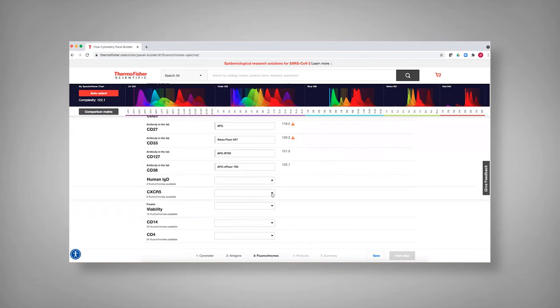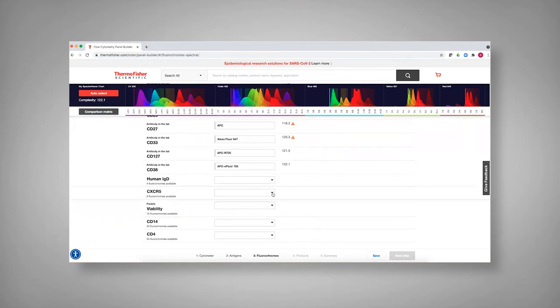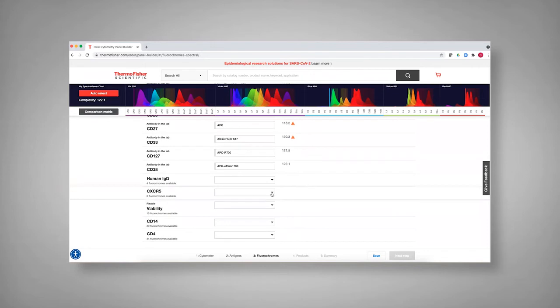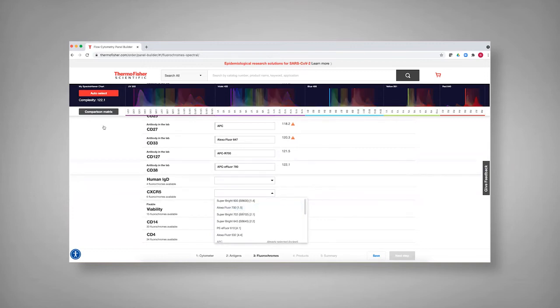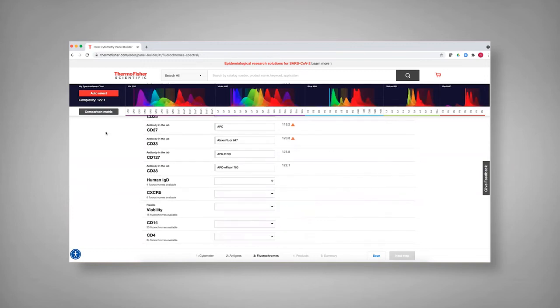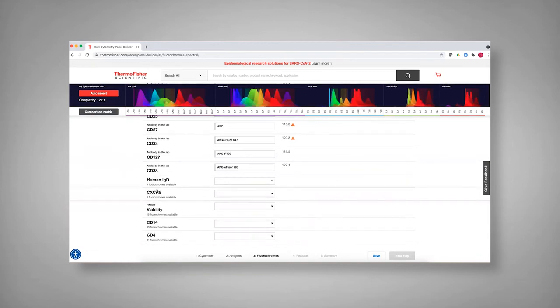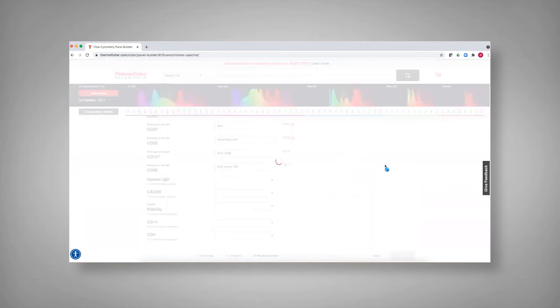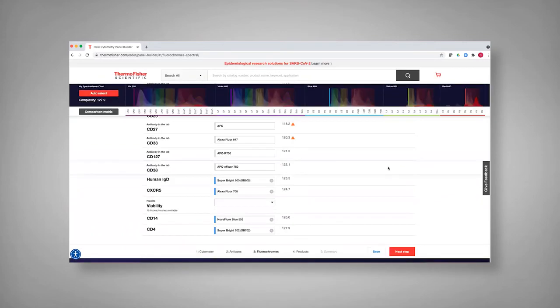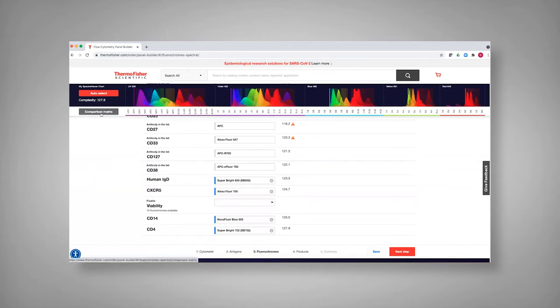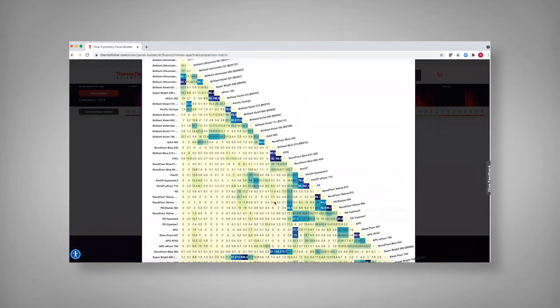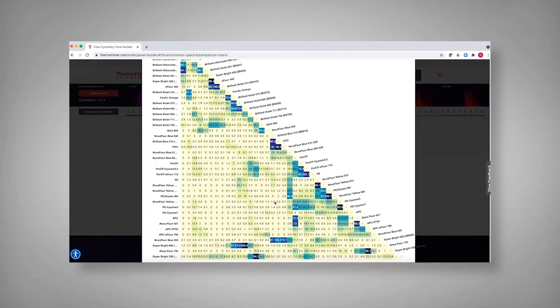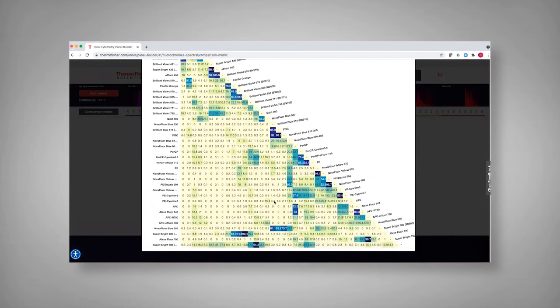In addition, then as you select these, you can see that some of these are going to be more bright dyes. For instance, Super Bright 600 is going to be bright versus Alexa floor 700, which is going to be a dimmer dye. And so if you just want to allow it to computationally assess what you should add, you can say auto select. And what you see now that's happening is it's actually going through and saying, of those available dyes, what adds the least complexity. Now, I would still suggest going back to the comparison matrix and really assessing places where these might be more similar than you'd really want to use.